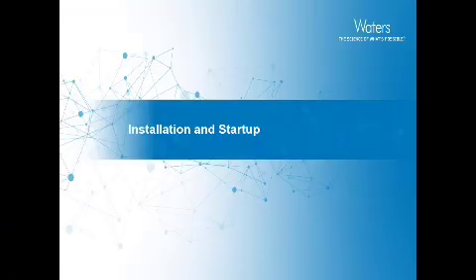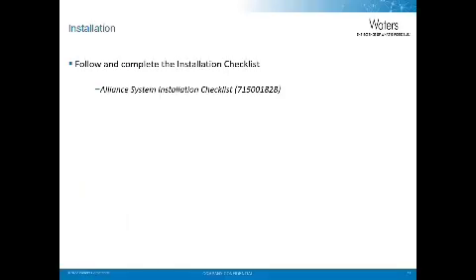Next, we will discuss installation and initial startup. Always remember to follow and complete the installation checklist at the time of the installation. The checklist number is shown here. Make sure to follow all applicable steps of the checklist.